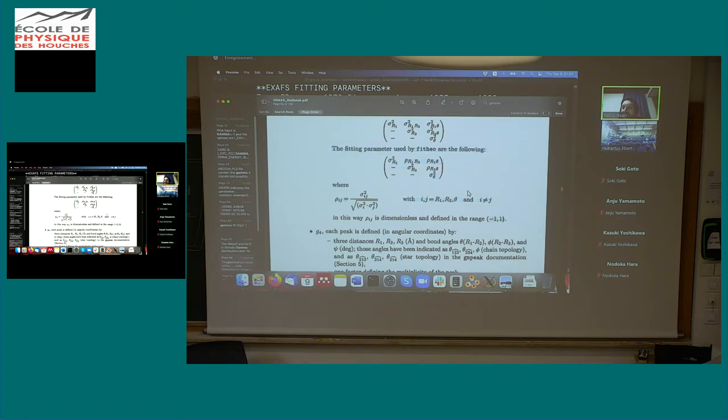In this case, it's easier for humans to understand how to decide the initial value of these parameters. So in case these parameters are totally uncorrelated, this will be 0. And in case they are positively correlated or negatively correlated, this will go towards -1 or 1.